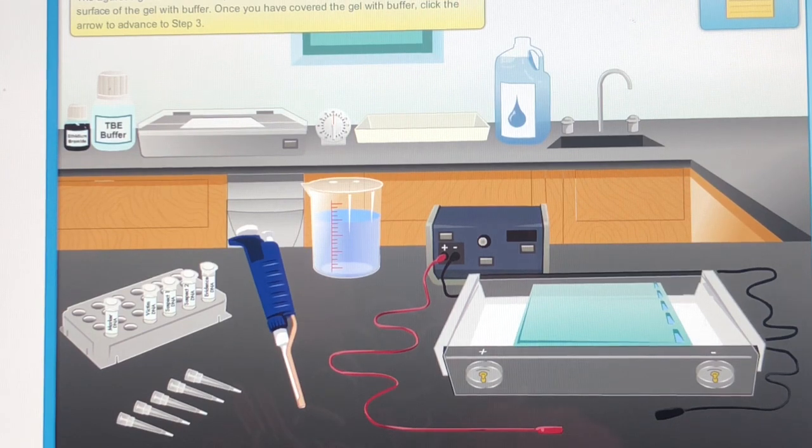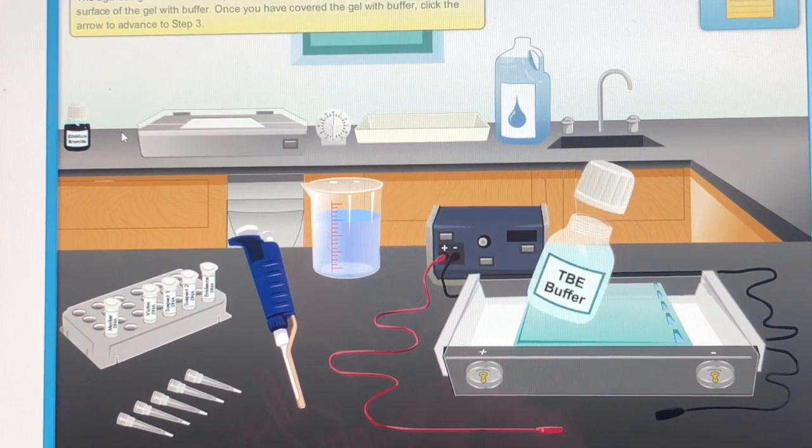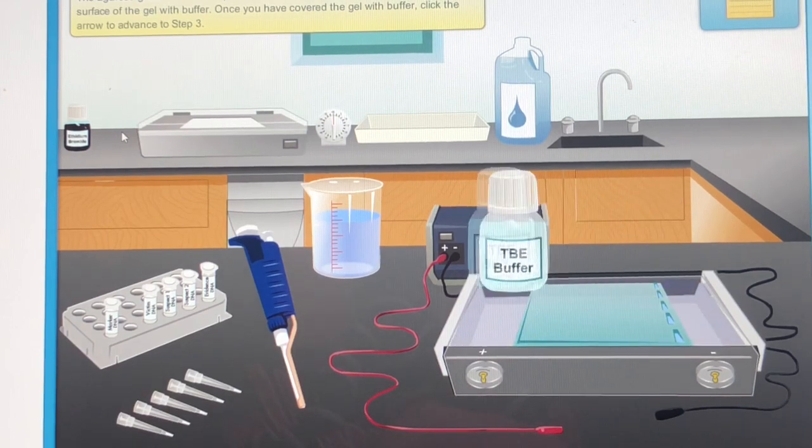The agarose gel is in the electrophoresis chamber. Click the TBE buffer to cover the surface of the gel with buffer. Once you have covered the gel with buffer, click the arrow to advance to step 3.